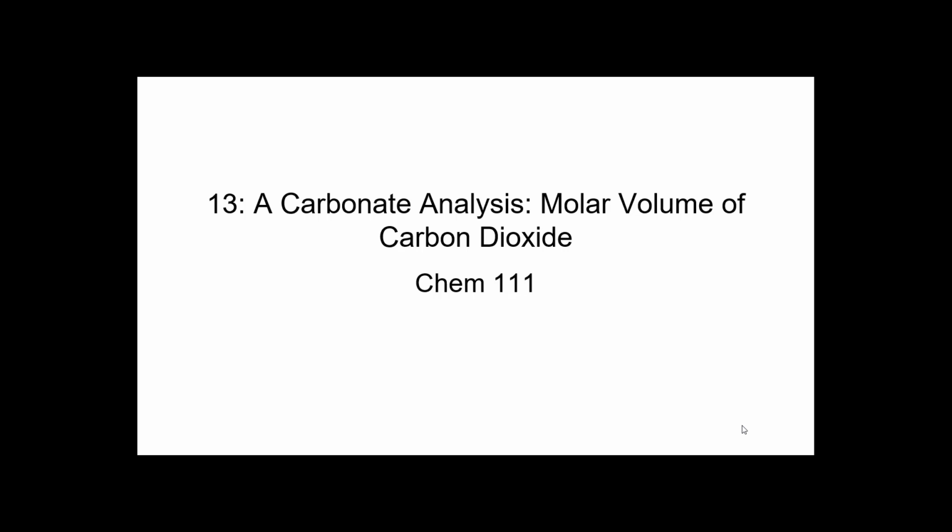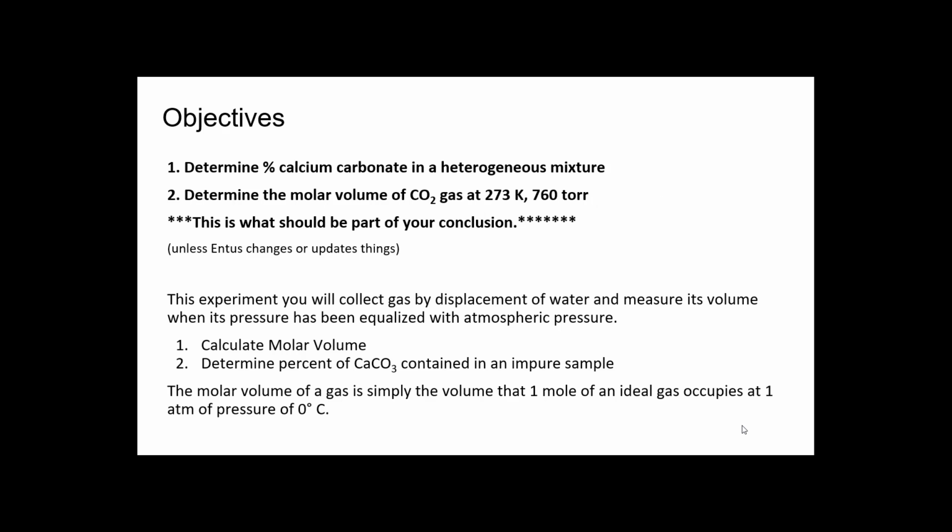The second trial is not usually as bad once they understand how they have to set it up, and then it goes pretty fast after that. So let's get started. So the objectives of this, you should always look at the objectives. I realize that we're not inside the lab to do this, but when you write up your lab, these are what you would be giving me in your conclusion.